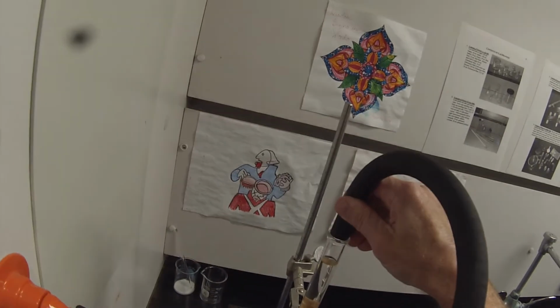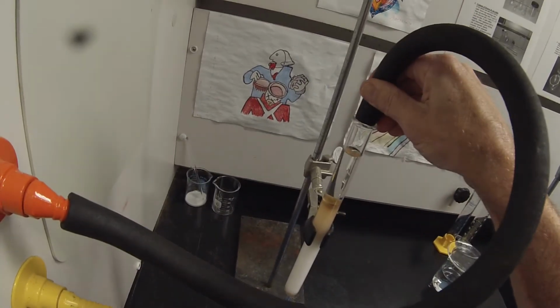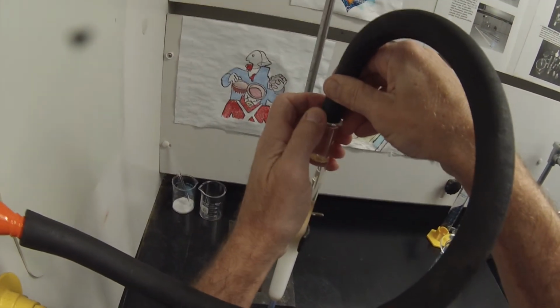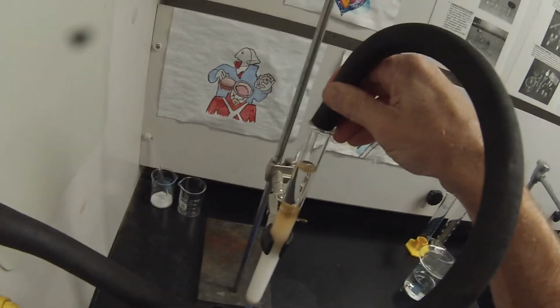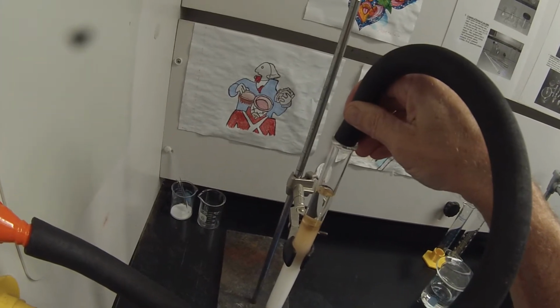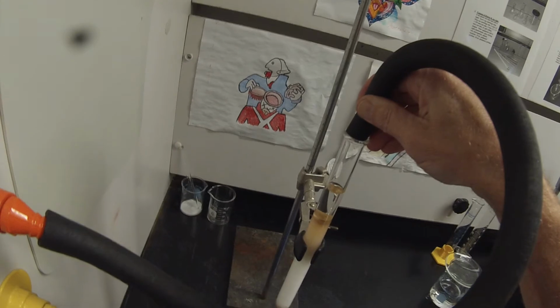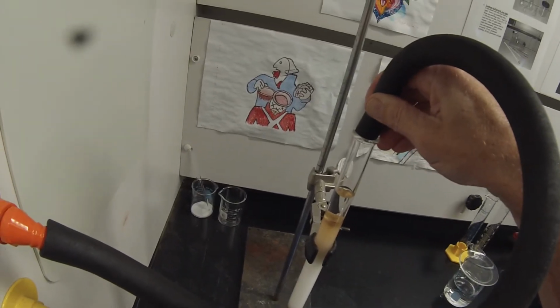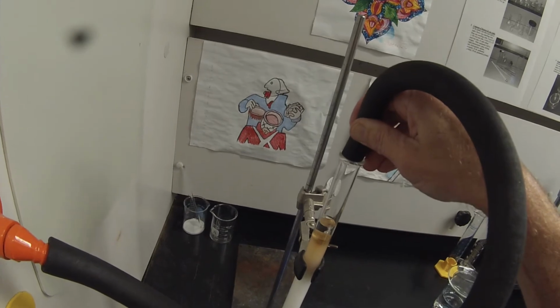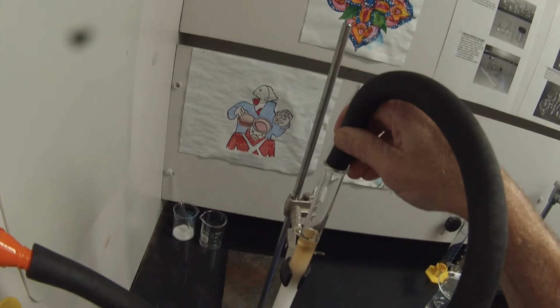But I'm hoping I'm going to slow the vanillin down by pulling that extra ether that I had to use, because I probably used about a milliliter of the mixture and 2 milliliters of ether in the end to get it loaded onto the column. And you can see that's going pretty quick. I get about 2 tubes before I have to refill.